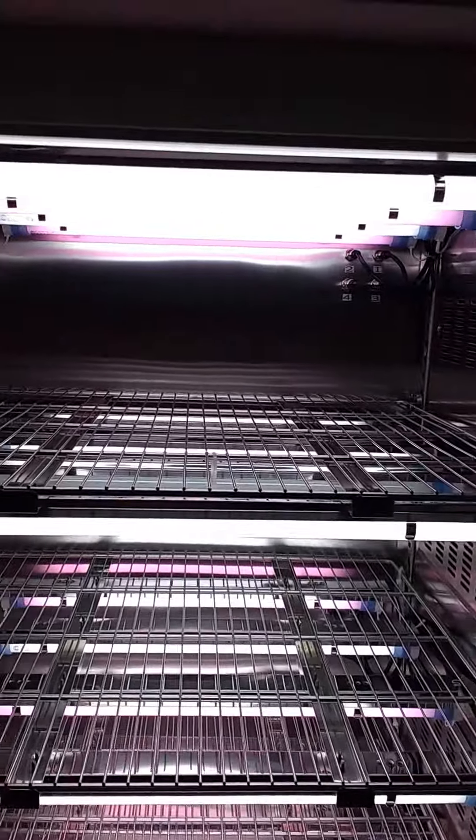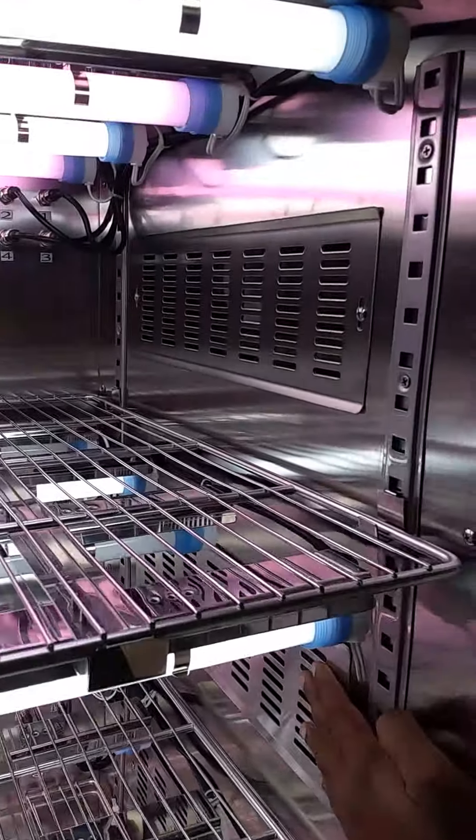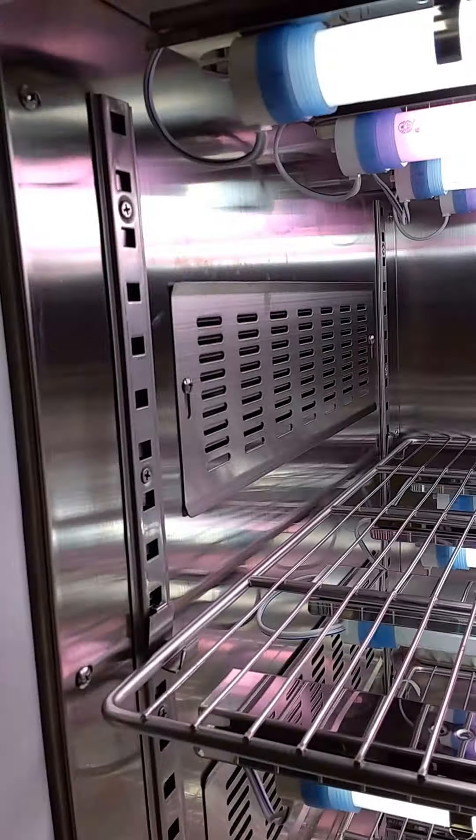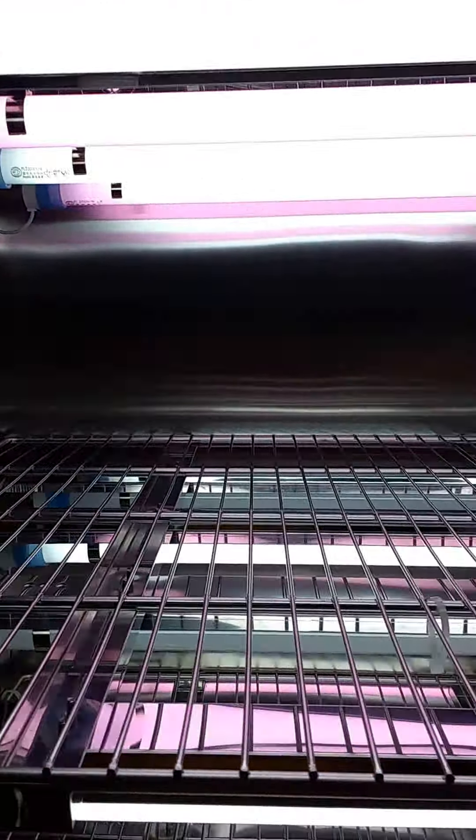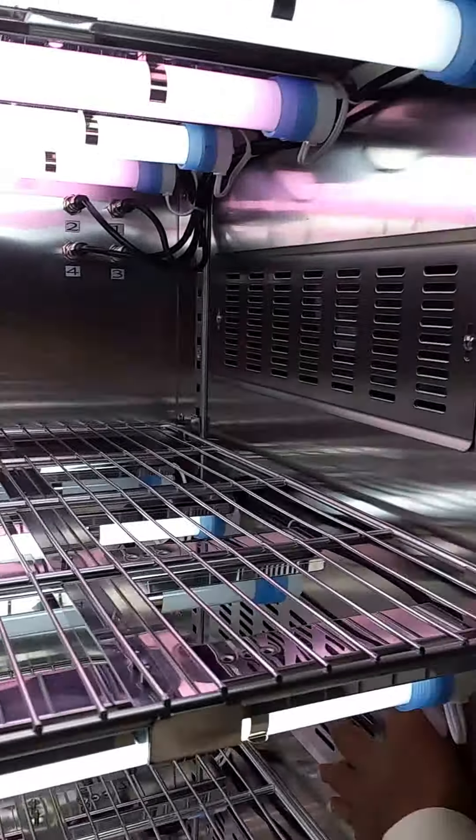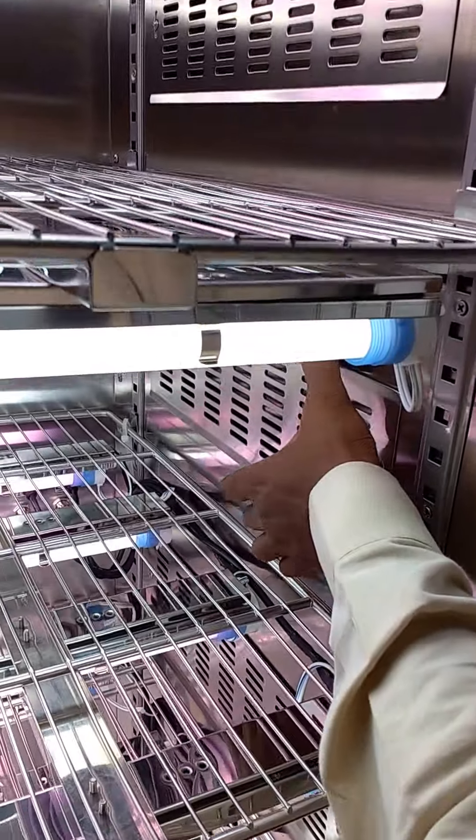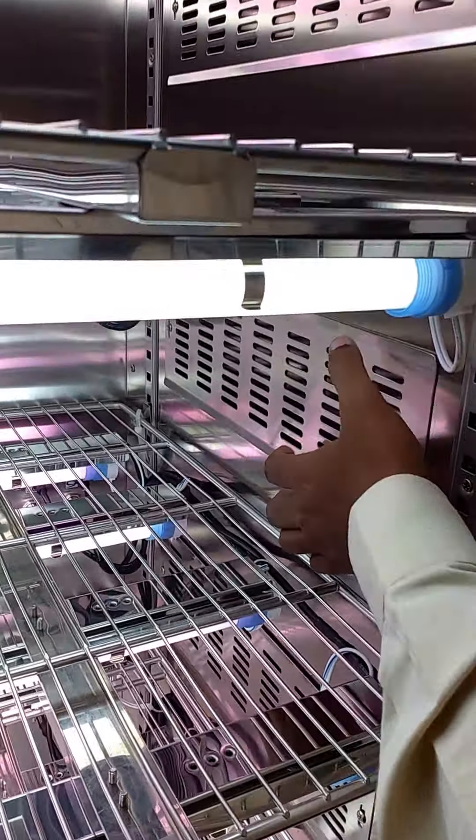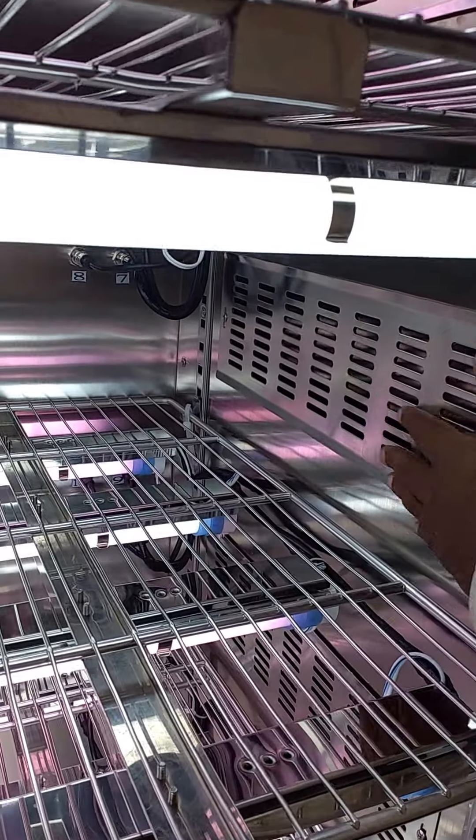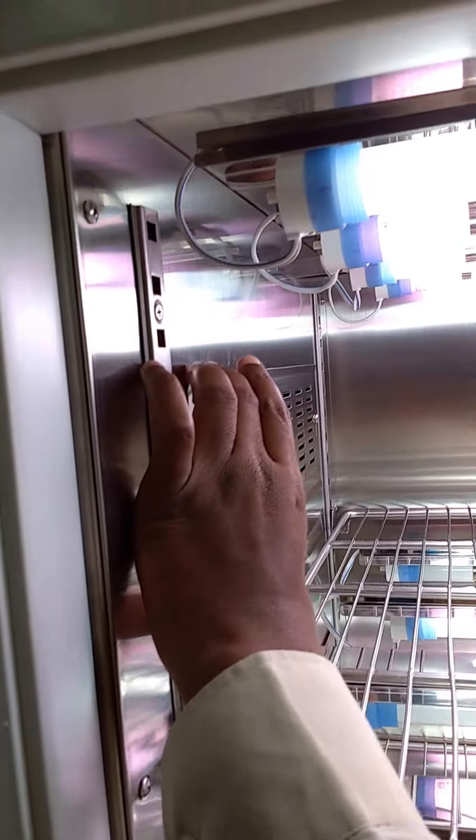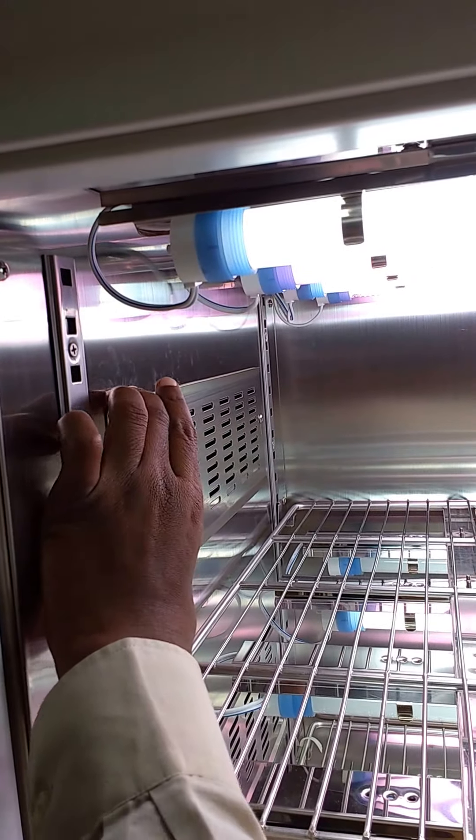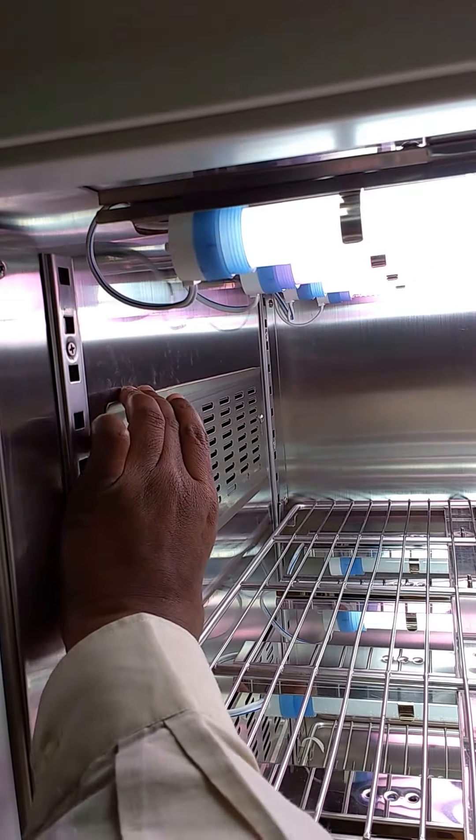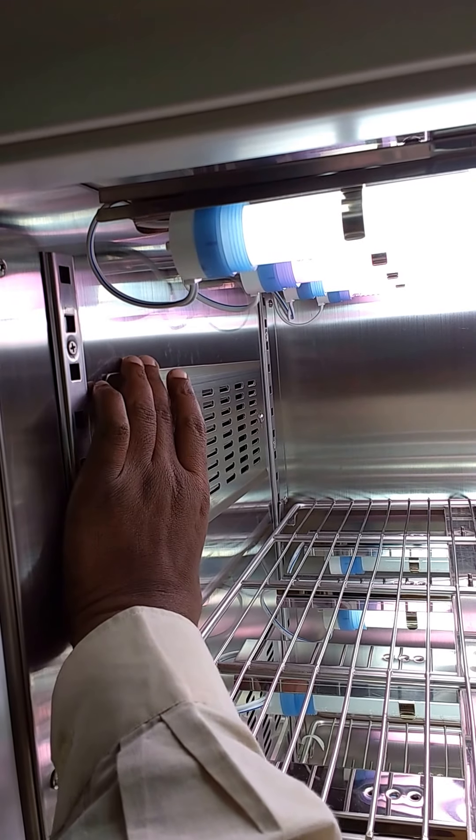Coming to air circulation, it has a side-to-side air circulation mechanism. These are the plenum walls that allow exceptional air circulation. These air vents can be closed and opened with just a little force.